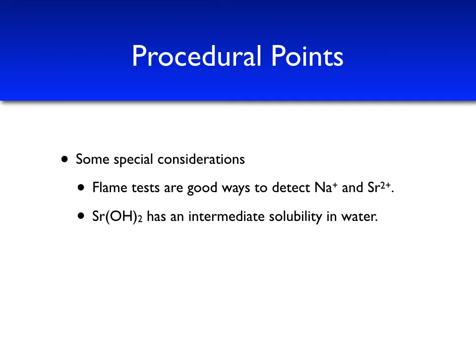Therefore, it's very important to note that perhaps in part one, there might be cases where we see a very slight precipitate, which may give away the presence of strontium hydroxide. However, for your unknown solutions, the concentrations will be such that for any formation of precipitate, you should assume that strontium hydroxide is not the identity of that precipitate, for part 2 only.